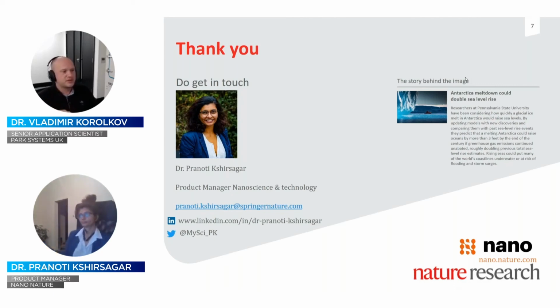Is that the perfect imaging mode for all samples and all situations? Well, probably no. And you might want to use non-contact mode for other situations. But again, as usual, you have a choice of imaging modes to use for your particular samples. So the question should always be, what is the best imaging mode for that type of sample to get that type of information? And then you can say, okay, well, that's your best option, really.